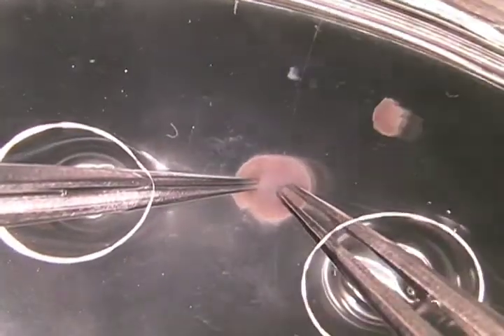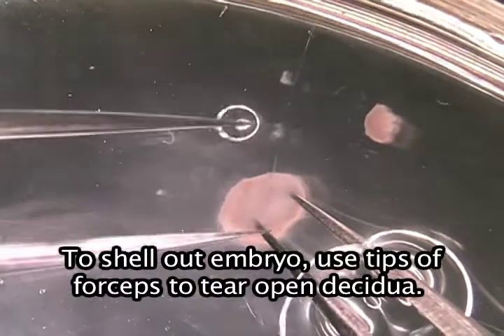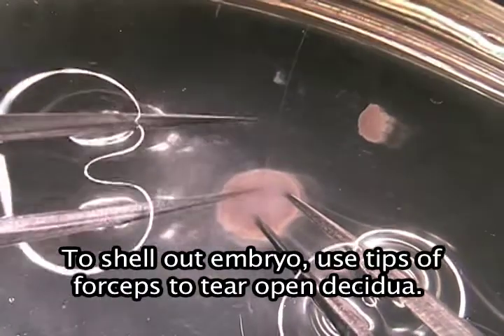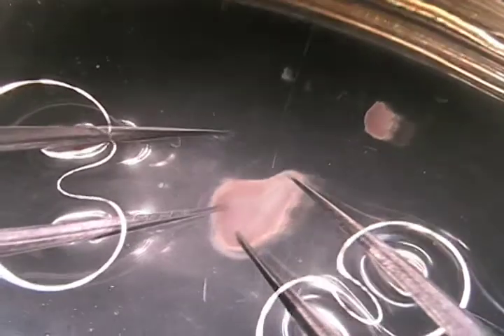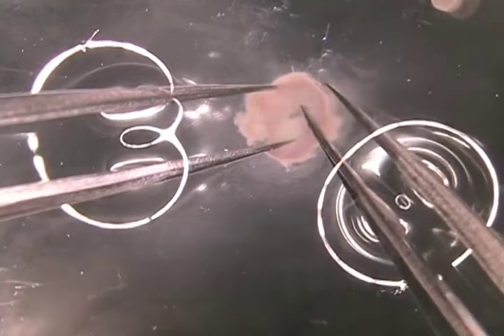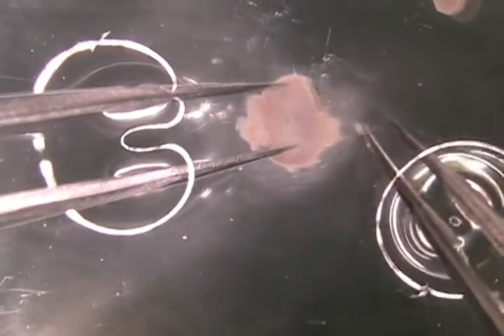Just want to pry the forceps in there. So at this point, the embryo sits very loosely in the deciduum. Once you pry the deciduum open, you can basically pop it out relatively easy as long as you get up underneath the base of it.